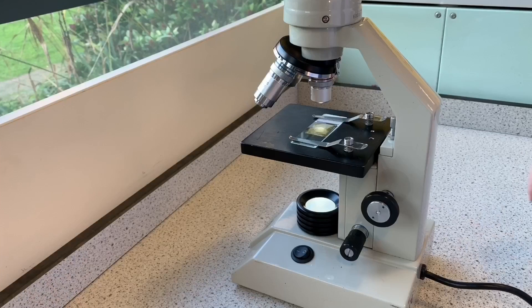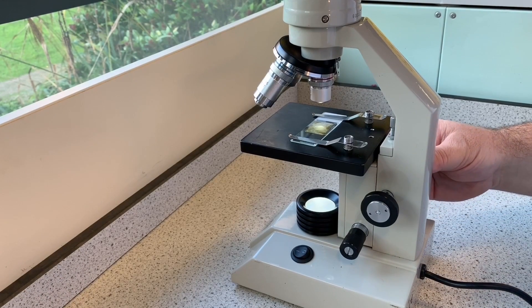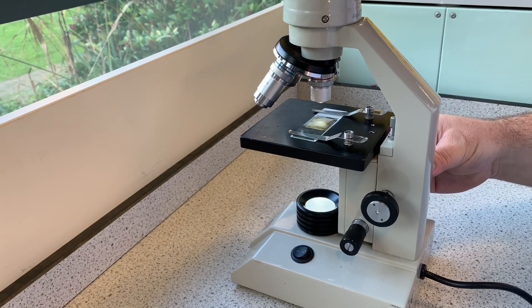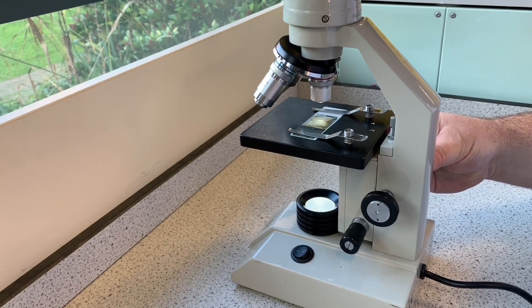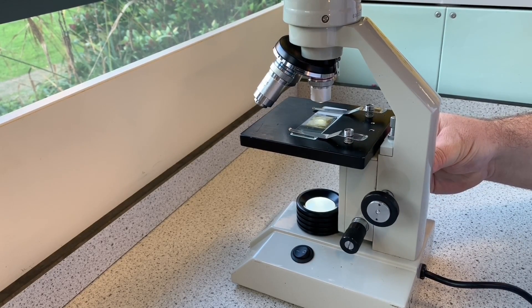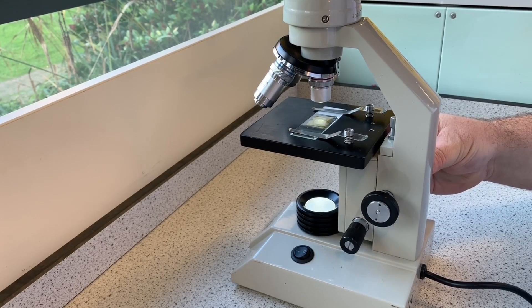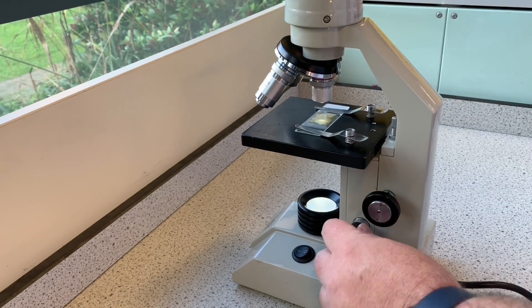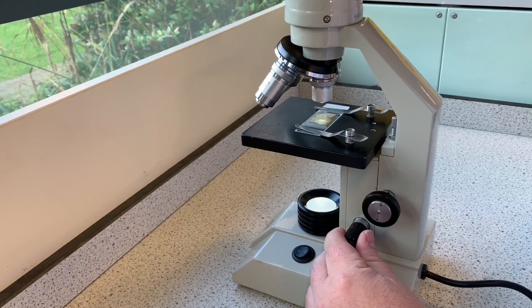There's our slide. To view the onion cells, we put the stage into its lowest position and put the objective lens to the lowest magnification. We then turn the coarse adjustment knob and gradually bring the specimen closer to the objective lens. As it starts to come into focus, we'll notice that it might be a bit blurry. This is the point at which we use the fine adjustment knob to improve the focus.